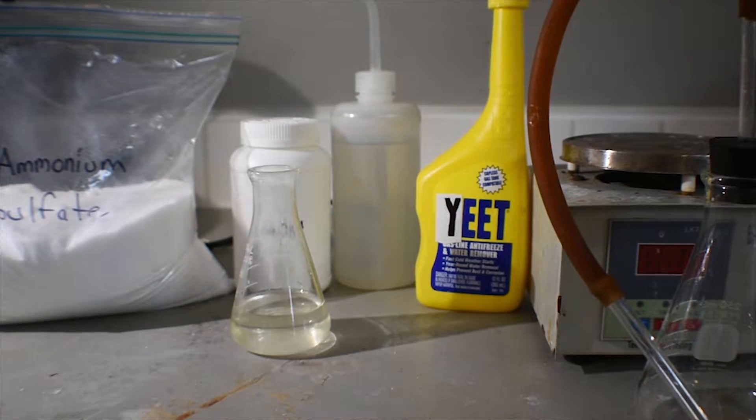Hello everyone, welcome back to another video. Today we're going to be making an addition compound of trimethylborate and ammonia.